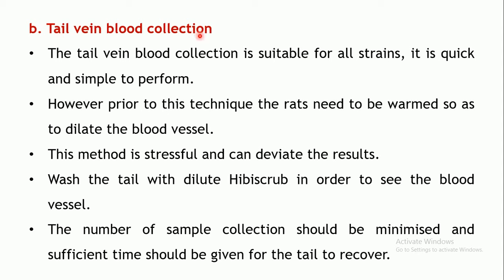The next technique is tail vein blood collection. As the name implies, blood is collected from the tail vein. This is a commonly utilized technique applicable for all strains, and it is quick and simple to perform. Sometimes the animal may need to be warmed slightly to dilate and expose the blood vessels, though this can be stressful to the animal and may affect experimental results. The tail is washed with dilute hibiscrub to make the blood vessel visible.